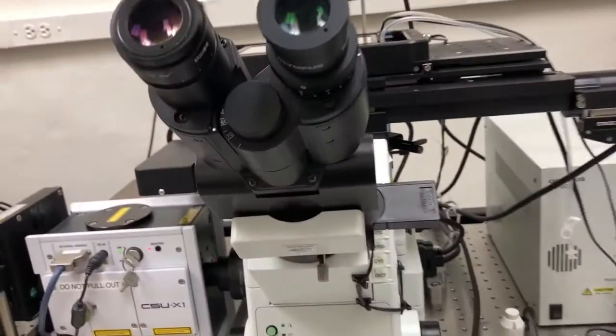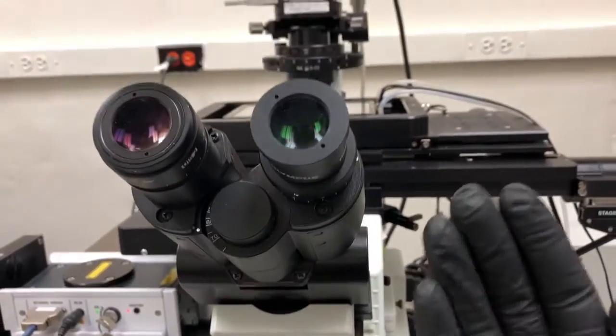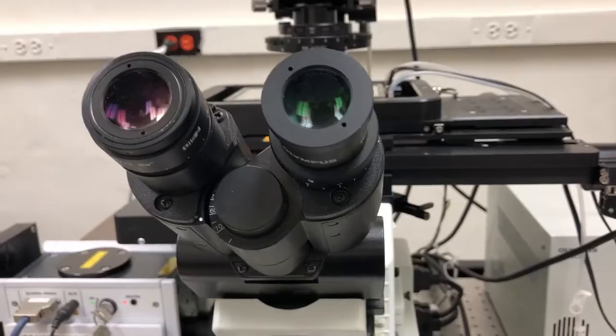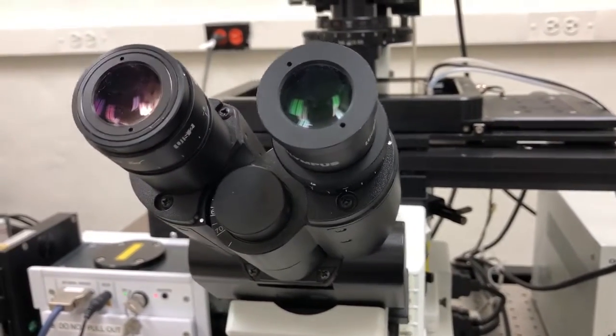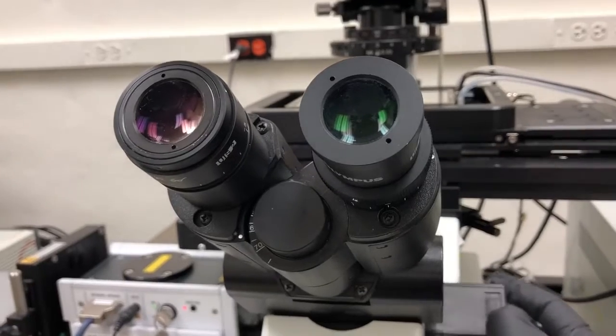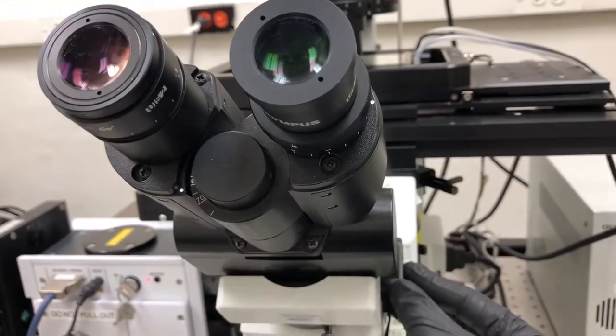First, we need to make sure that we push this slider in to block the ability of light to reach the eyepieces. The reason for this is, as I said before, this triggers an interlock with the lasers. If this is pulled out, the lasers won't turn on, so we won't be able to see anything. I'm going to push that in.